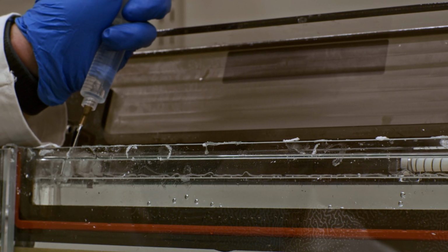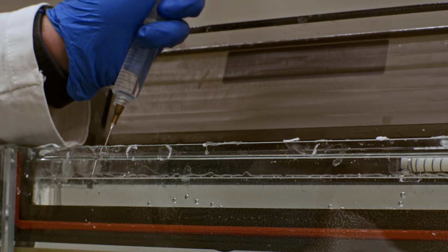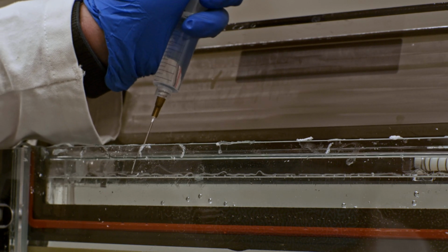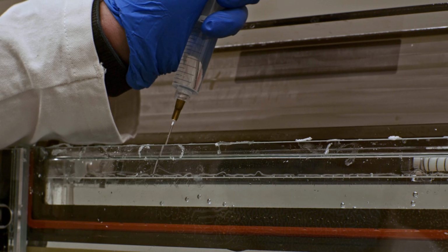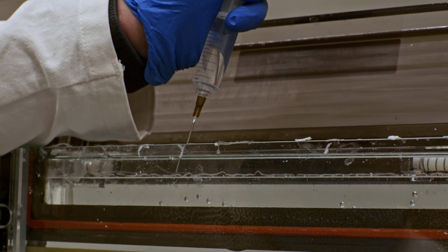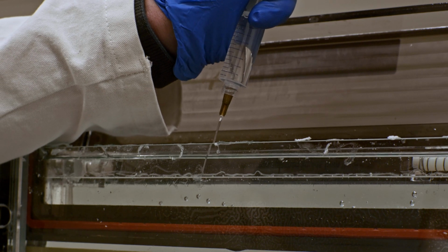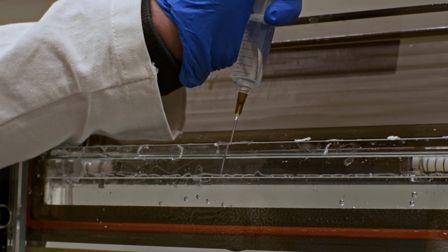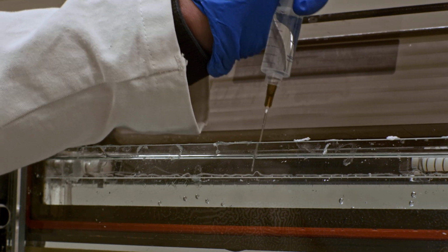This is also a really good time for you to assess which wells you want your samples to go in. Because when you take out the comb from your gel, sometimes you may not see the tearing of wells until you begin this part. And so it's important to assess if you have nice wells in order to accommodate your samples. In today's experiment, since I have 32 samples and 36 wells, I can only use a few of them and get rid of a few if they don't look good.